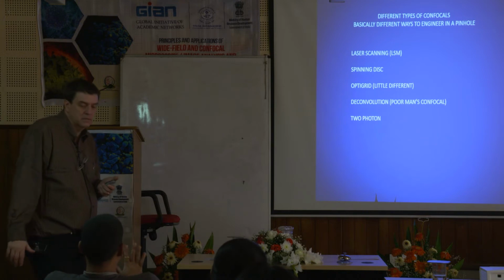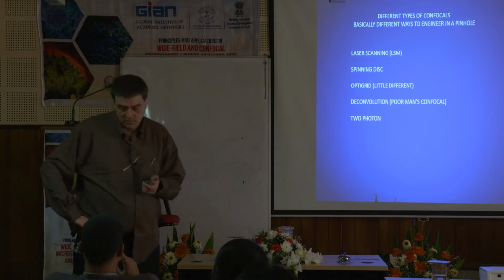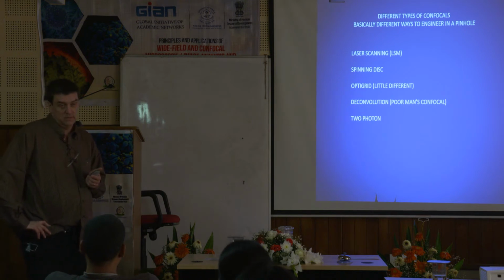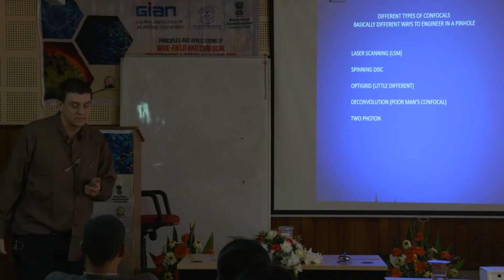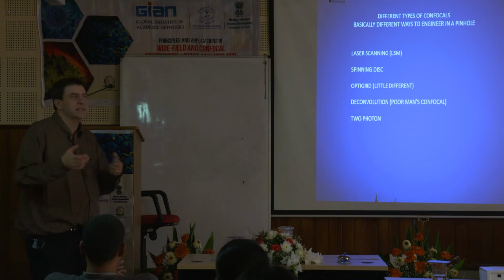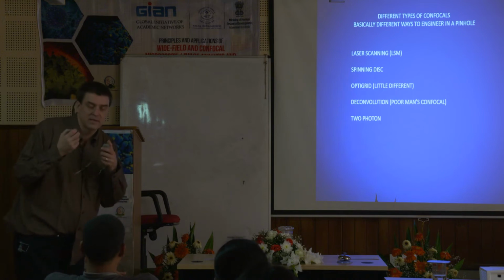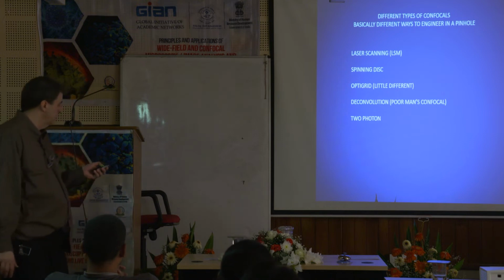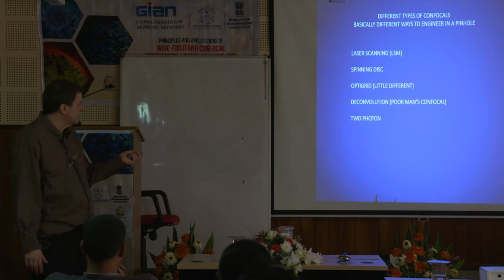Okay. In general, if I say confocal means it is involving pinhole. Yes. And it is about 3D. Yes. Correct. I guess you could say that. Yeah. The take-home message is it involves a pinhole and it has to do with 3D. Right. Okay. So let's look at a couple of these different kinds.